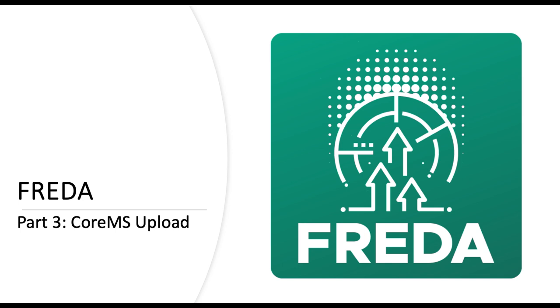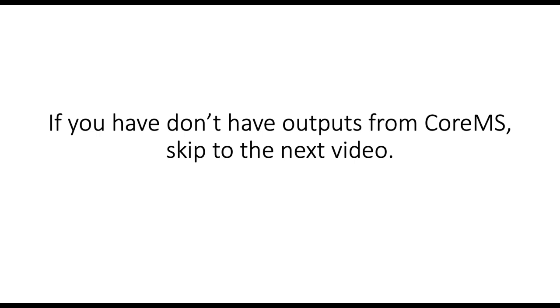Here we will cover how to upload your FTMS data to FREDA if you are uploading from CoreMS, which is an identification tool that matches spectra to molecular formulas. If you have already uploaded your data, skip this video.